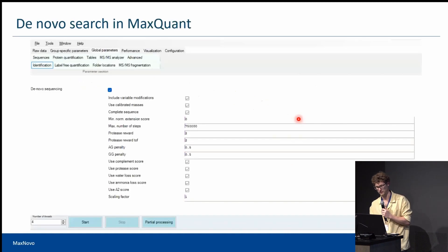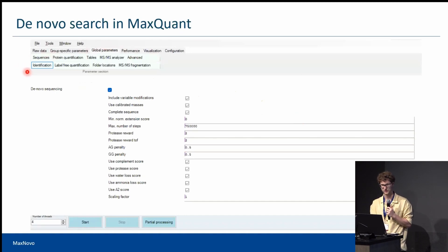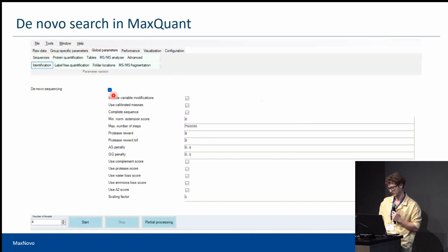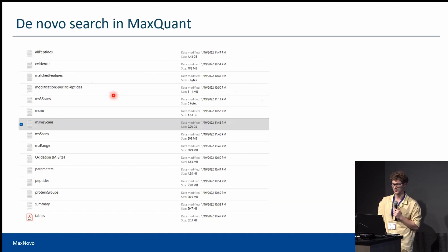To enable de novo search in MaxQuant, go to Global Parameters and the Identification tab, scroll down and check de novo sequencing. The results of de novo sequencing can be found in the MSMS scans table.